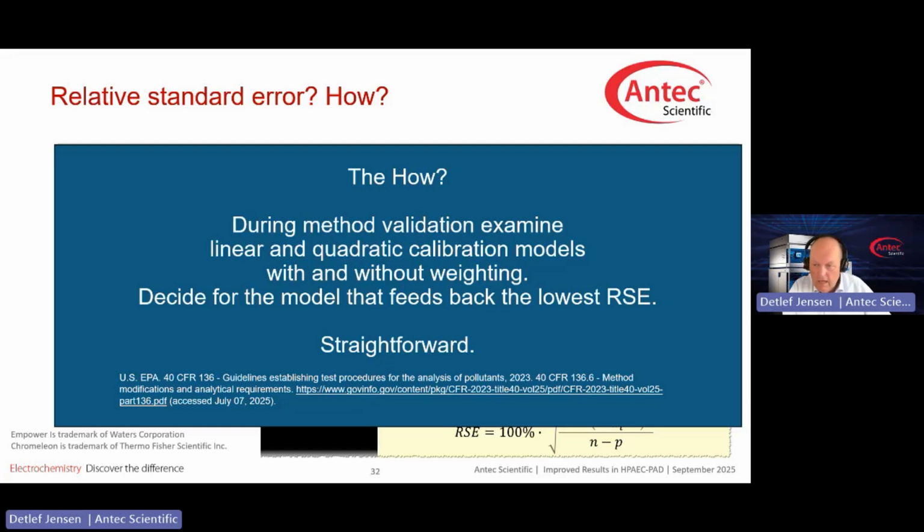to double check. But I can tell you from own experience that this was a big eye-opener. It explained why in my calibration curves, and I'm talking about myself, the deviations consistently increased with decreasing amounts. Since I follow the RSE concept, that has changed, and the quality of the data has significantly improved.